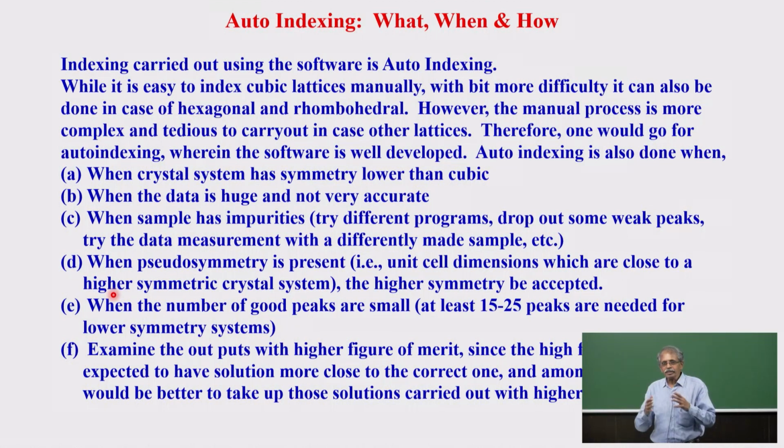When the symmetry is not very accurate, and some kind of pseudo symmetry is present, then again the manual way of indexing is not very easy.